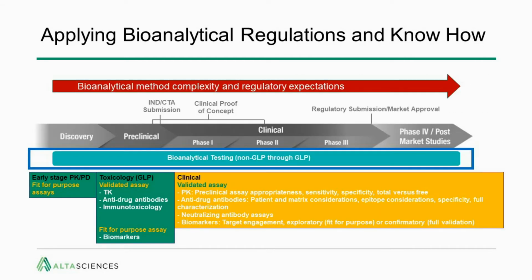Challenges for biologics development include applying bioanalytical regulations and know-how. Since bioanalytical method complexity and regulatory expectations increase throughout development, this is certainly a challenge. For example, in early phase discovery of biologics, the bioanalysis consists of early stage assays for appropriate pharmacokinetic and pharmacodynamic analysis, and these assays are mostly fit for purpose.